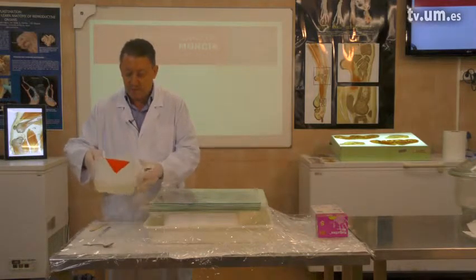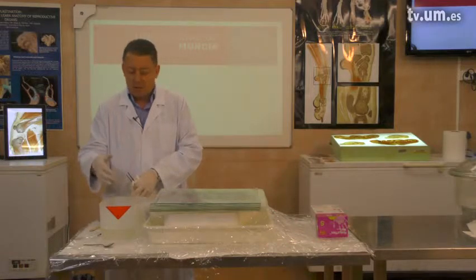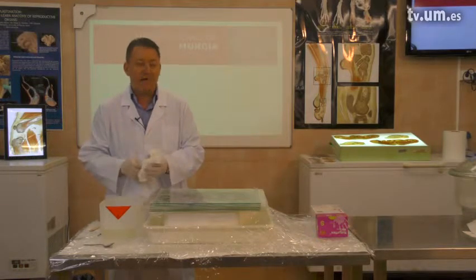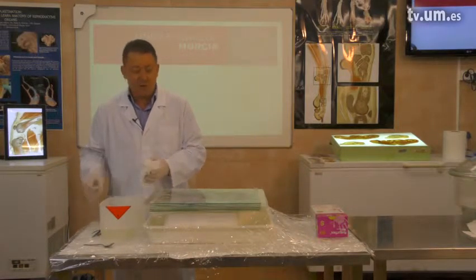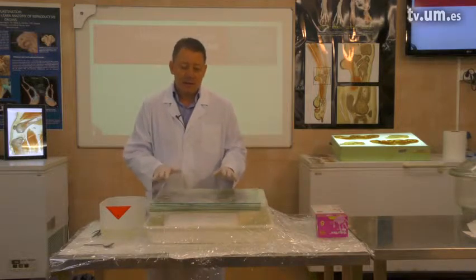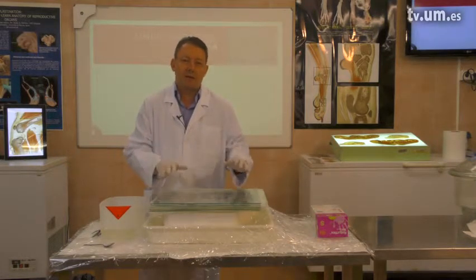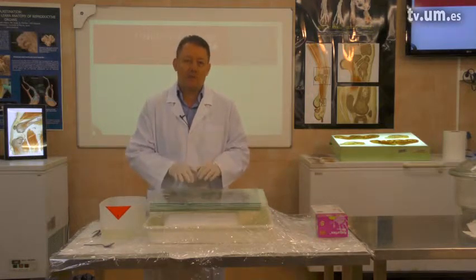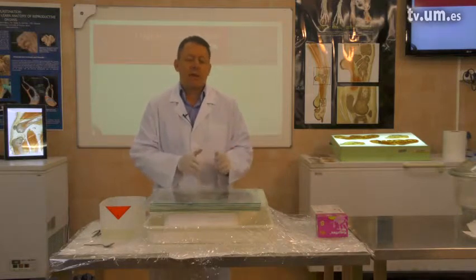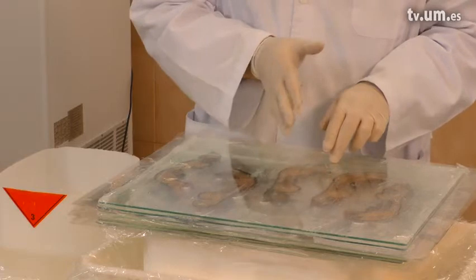Keep the impregnation bath — it's your resin where you can see how hard it becomes after one day. You will watch it after one or two days and see when it's hard. That means the slices inside are hard too. Usually epoxy resin — the E12/E1 mixture — gets solid after one or two days at room temperature. That means we close the entire package and let it sit in the room where you have plastinated at room temperature for two days. This is actually a pre-curing. After these two days, when the resin is solid, you move your block into the oven and place it there for four days at 45 degrees.